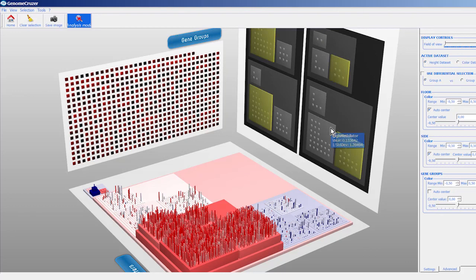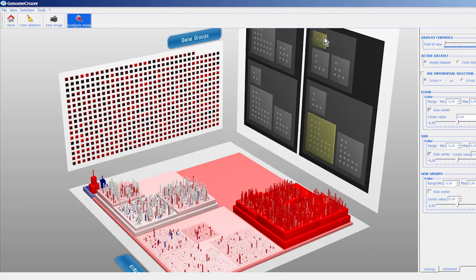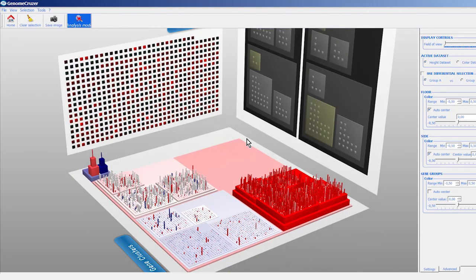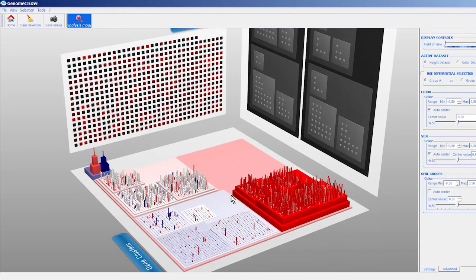On the contrary, if we select the high methylator phenotype, we can clearly see that their methylation pattern is complementary and essentially pertains to genes of the class A. So the segregation of the methylation pattern is quite evident among patients and leaves out the class C genes, for which no specific methylation can be found.